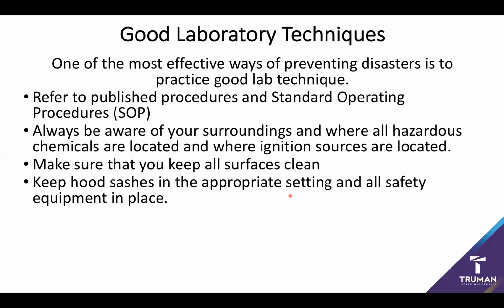And I've actually seen these hood sashes literally save lives. So those stops on the side of the hoods are there for a reason. You should never move the hood sash above the safety setting unless you actually need to temporarily move in or pull out a piece of equipment.